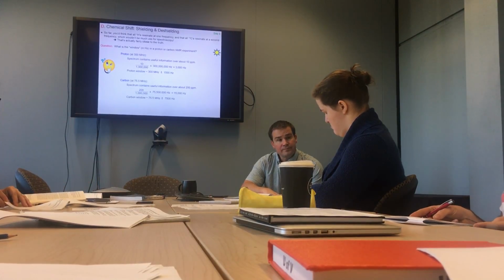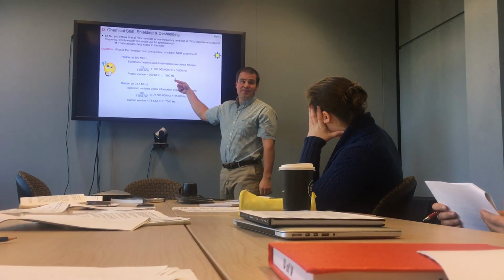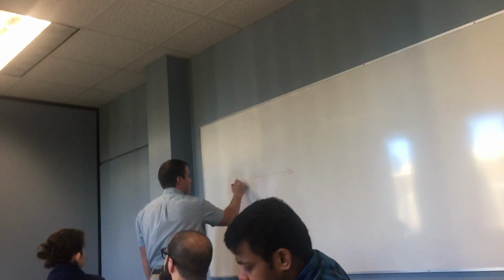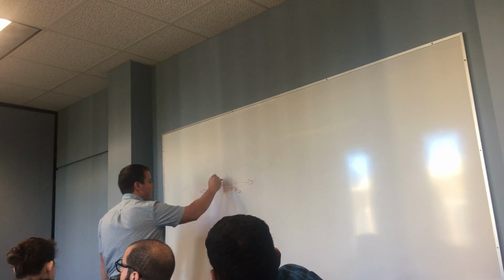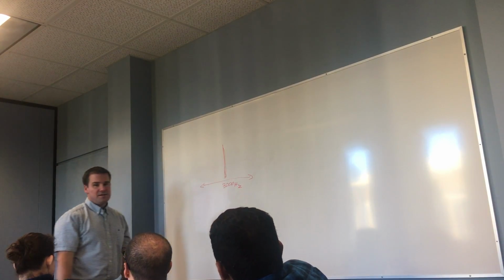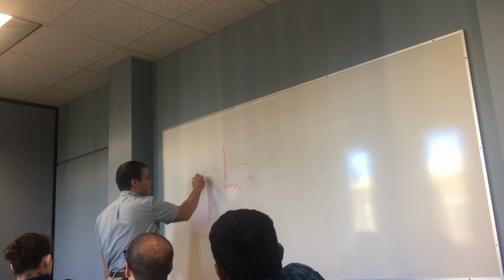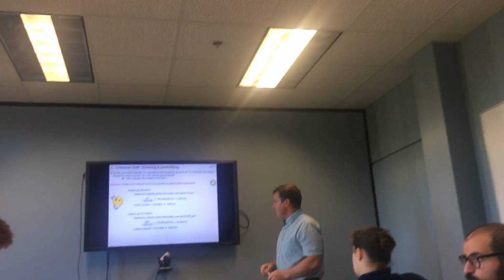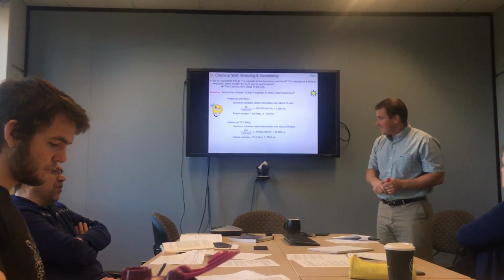Jeremy, I couldn't understand where the 1500 and the 7500 numbers came from. Oh, so I just divided this by 2. So the total window is 3000 hertz, right? Oh yeah, I see. So if that's 3000 hertz, that is your 10 ppm window. Somewhere in the middle, let's say, is 300 million hertz. 1500 this side, 1500 the other side. The middle is also known as your carrier frequency. You ever hear the term?